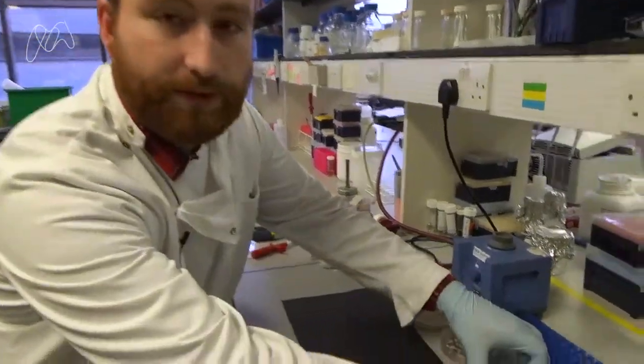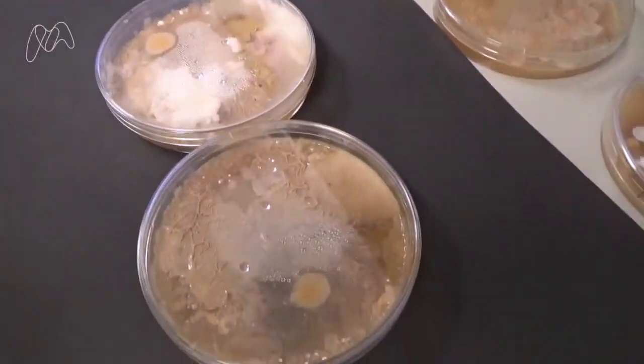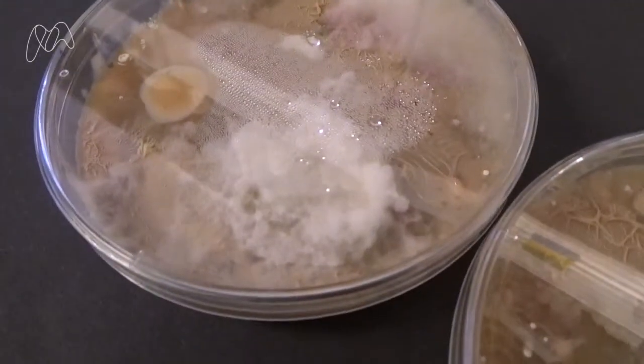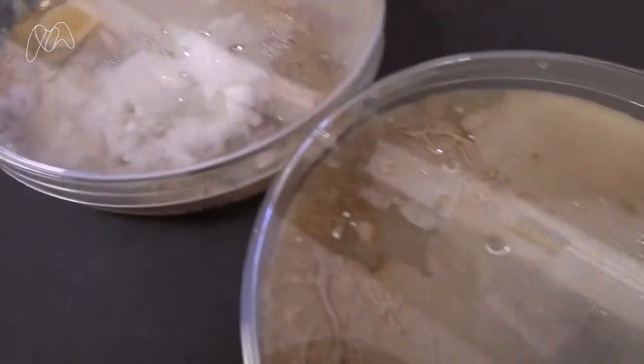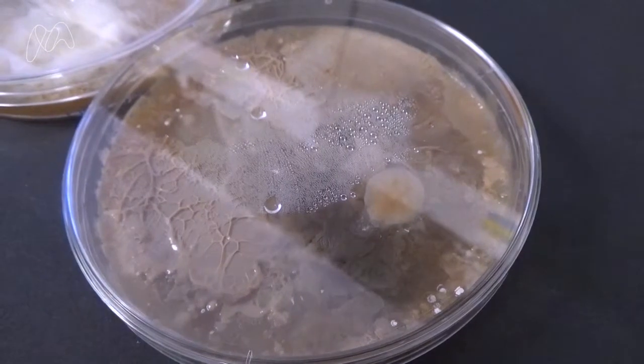We've got two examples of plates here. The plate on the left has had no anti-fungals added to it and as you can see it's completely taken over the plate — I'm not even going to take off the lid because it's not very nice. In contrast, a sample taken from the same place with anti-fungals is covered much more in bacteria.